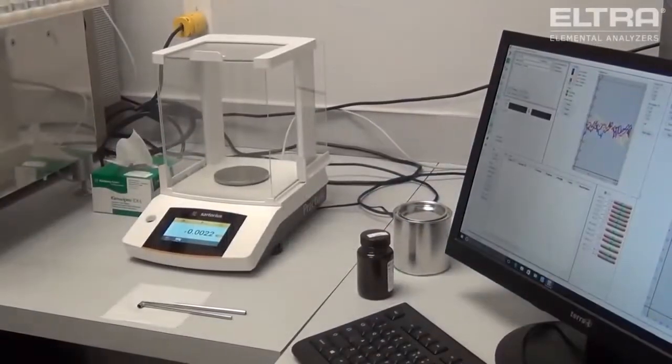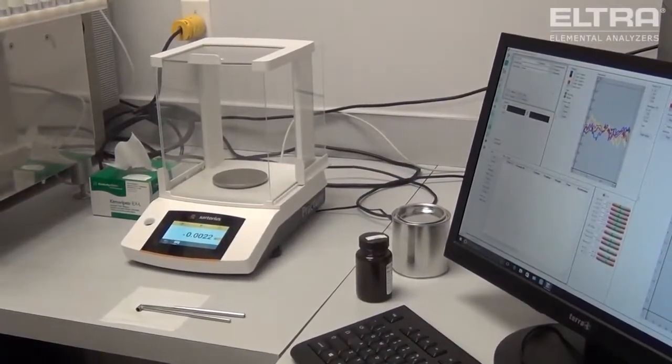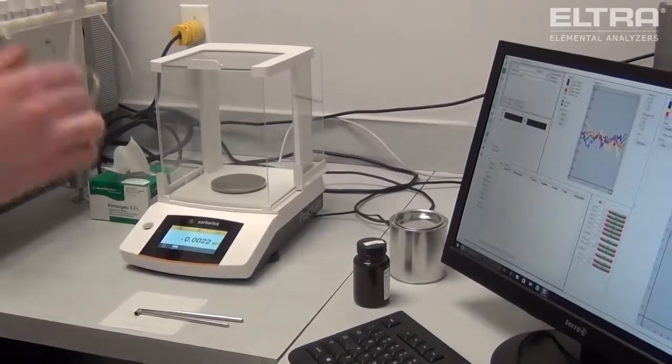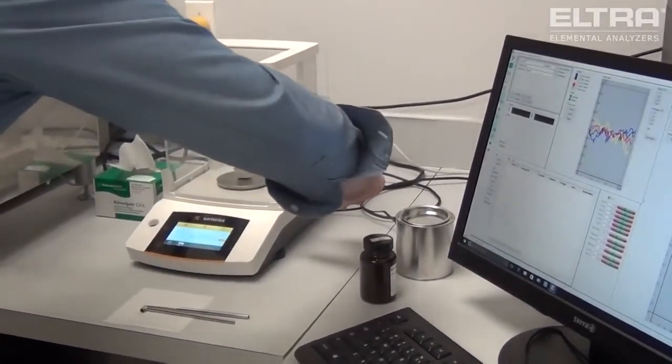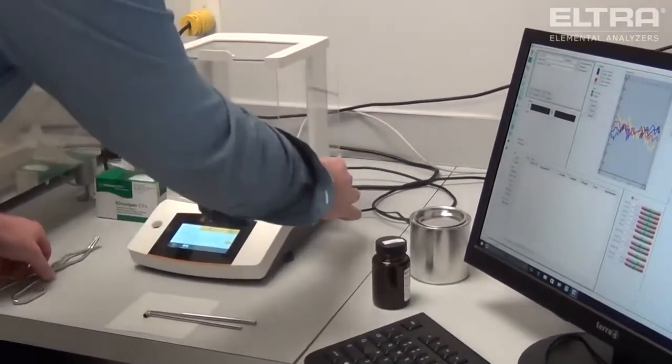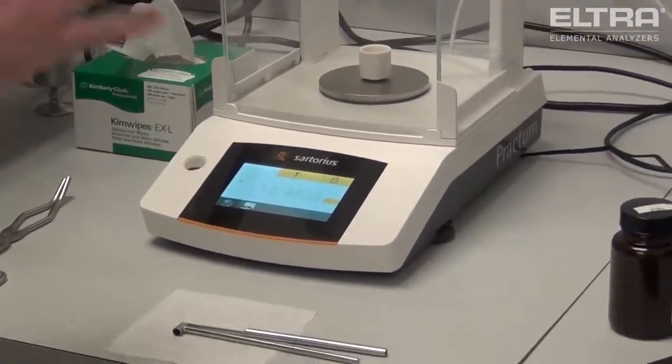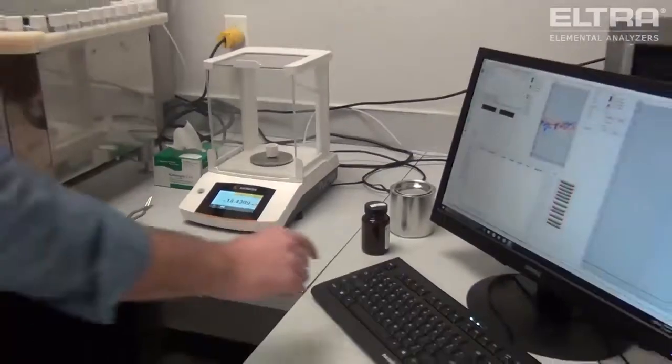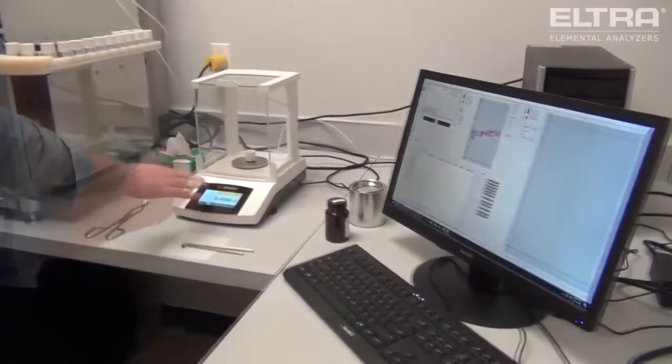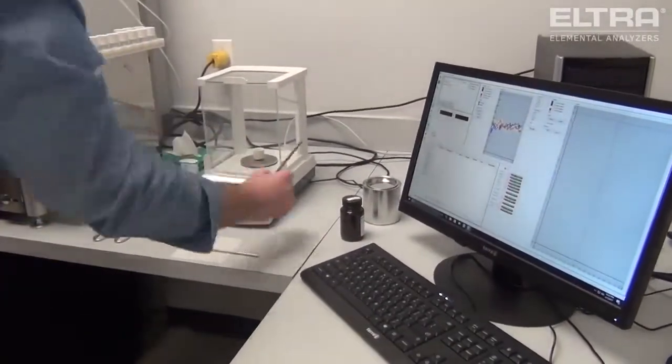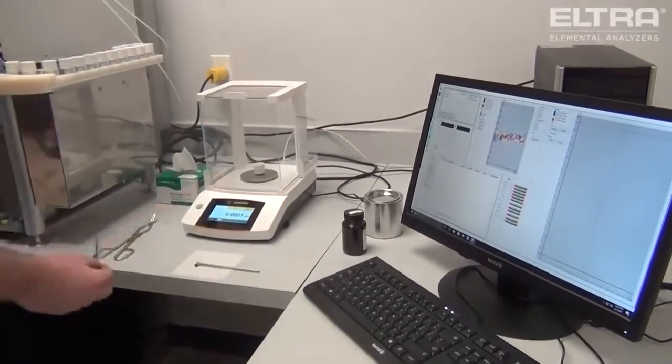Analysis with the CS-2000 is simple, easy, and very quick to do. Take your crucible, place it on the scale, and with the functionality between the software and the scale, taring the weight is as simple as pressing F6. The scale is now tared, and we can add our sample to the crucible.